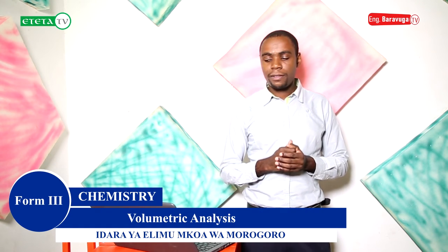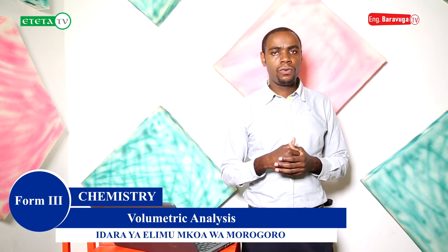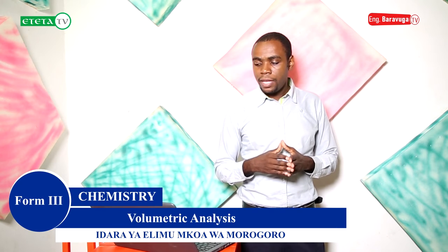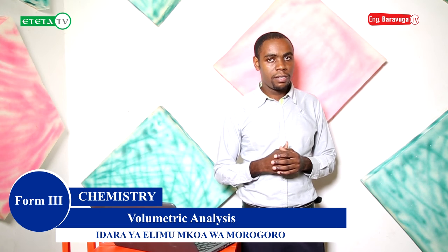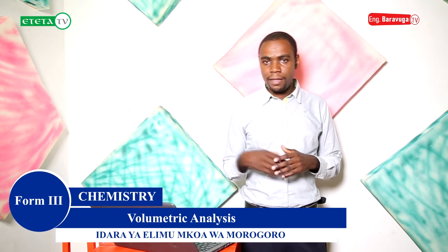Another is a wash bottle, and the function of the wash bottle is to store distilled water. Another is a reagent bottle, and the function of the reagent bottle is to store different chemicals, either acid, base, and other chemicals.